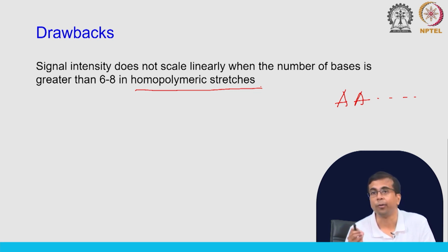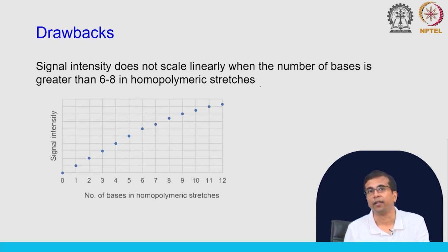Which means you could not determine the exact length of the homopolymeric stretch. Okay. So, whether it is actually 10 or 11 or 12 or 14, there would be confusion. Okay. So, this method gave a lot of sequencing error around these homopolymeric stretches, especially insertions and deletions. We will talk about these different types of variants that we can determine. So, what it means is that we got more error in the sequencing data in these regions.